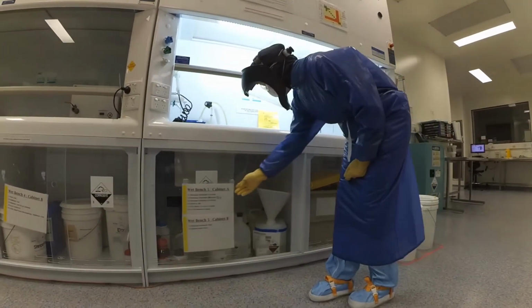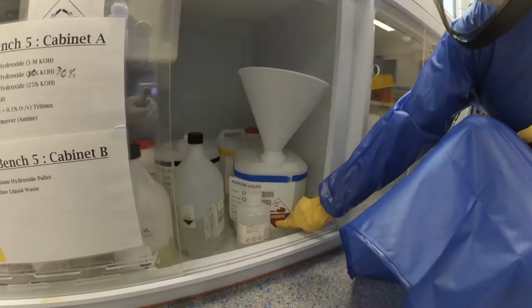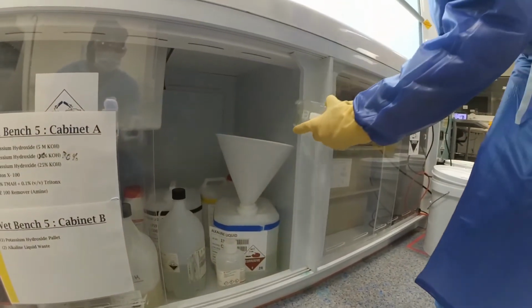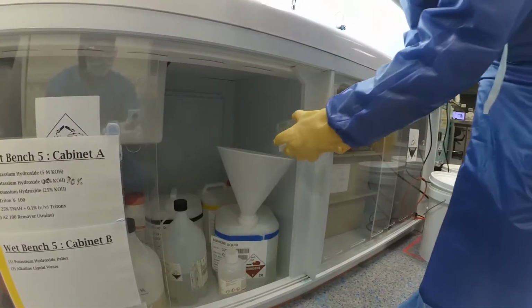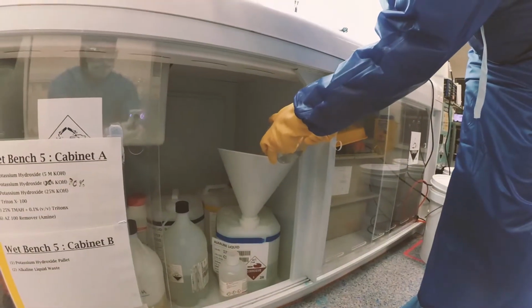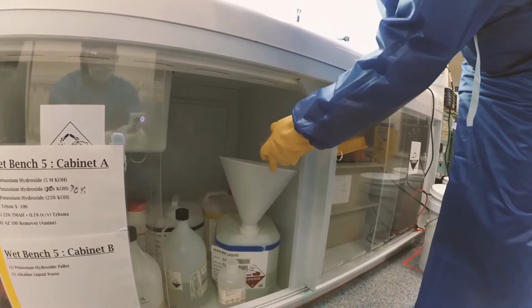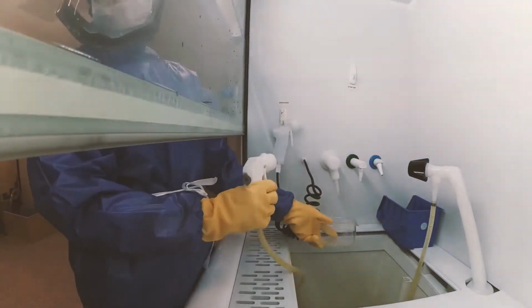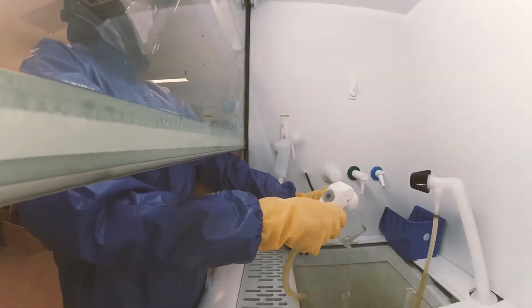Designated waste containers are stored below the fume hood. Make sure that your waste is disposed of in the corresponding waste container. Waste containers are labelled with a fill line. If the line is reached while disposing of chemicals, please contact a process engineer before continuing. The process engineer will swap the full waste container for an empty one so that you can get back to work. Once you have completed your experiment or process, triple rinse the glassware and leave to dry on the appropriate glassware rack.